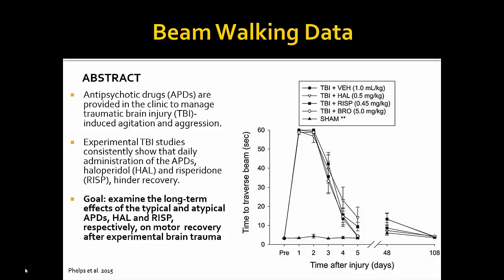And then when you do the TBI, your question is, are you impairing learning or are you just impairing a motor kind of thing? That is something that could be yes, could be no, but as long as you have your controls, then you should be okay.